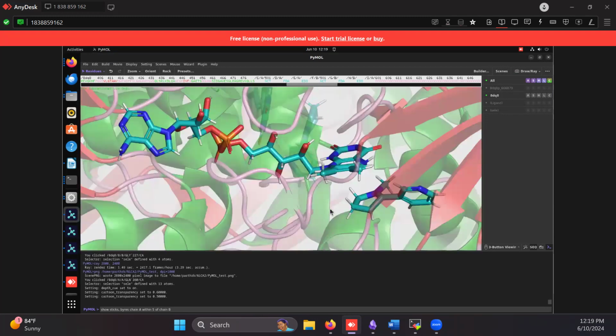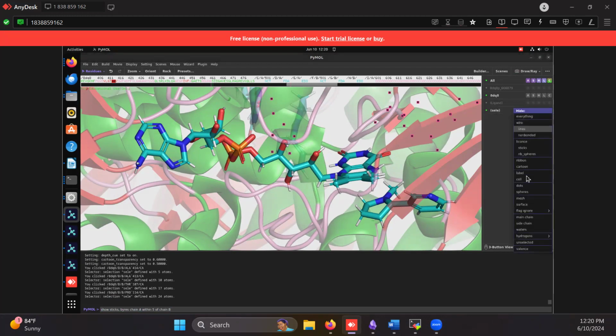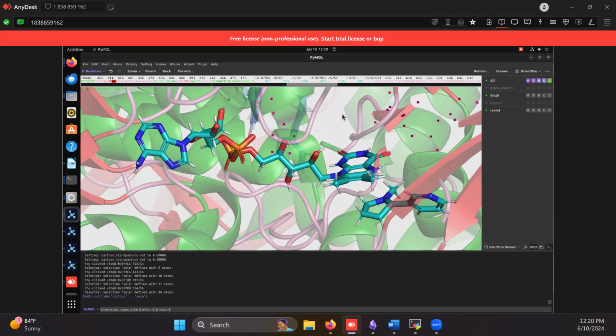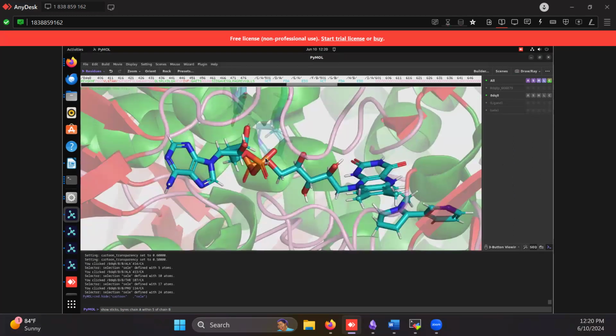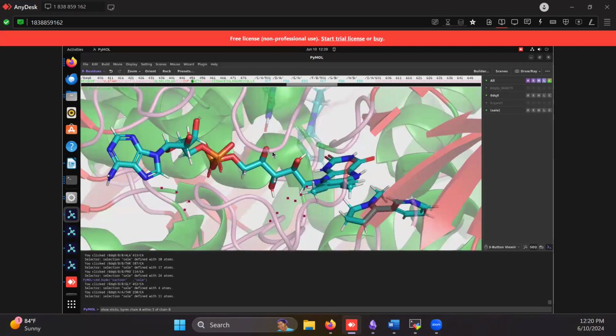But even then, there is a lot of clutter, right? So once you get to a point with your scroll, okay, this is how much I can scroll right now. You just pick parts which you think are cluttered. When you select them with your left mouse button, they'll make a selection. You can go and say hide. You can go and say hide cartoon, and it'll just hide that part of the protein. I think at that point, once you have your angle set properly, you want to go in and hide parts either in front or behind, which you don't want.